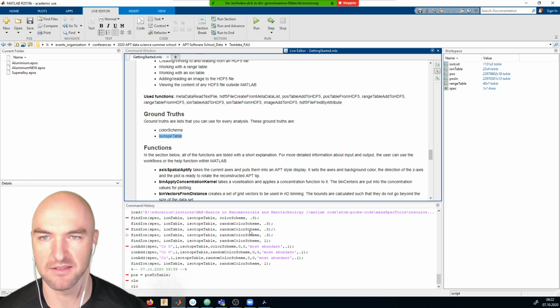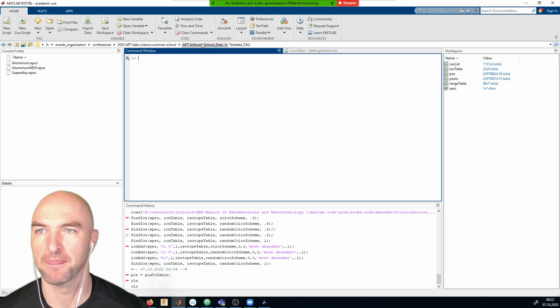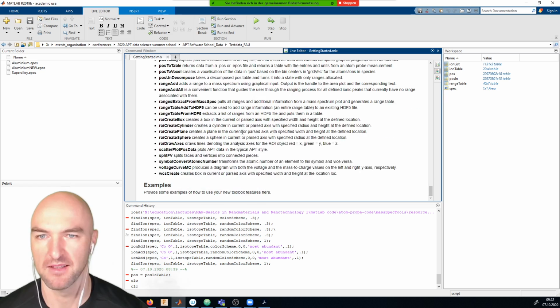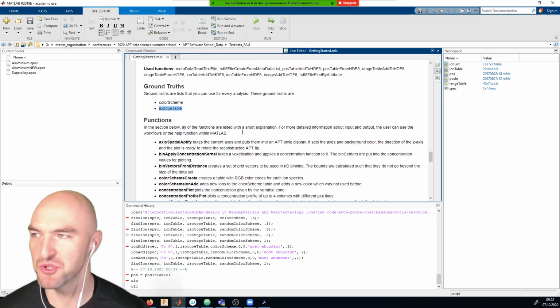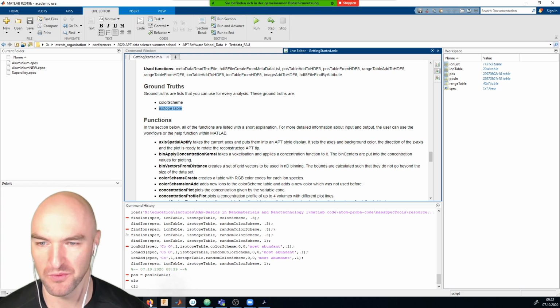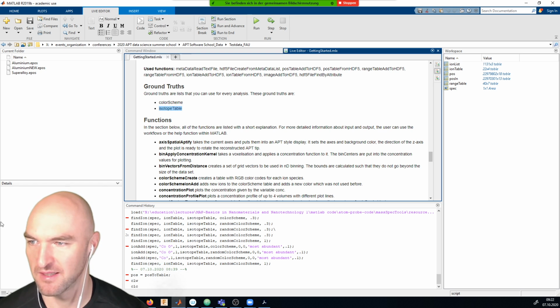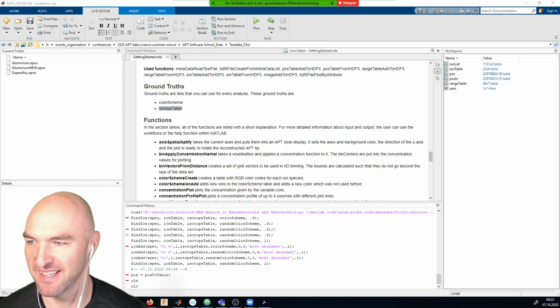I need to test that. Okay, usually I work off of the thing here. Okay, so how do I get to the isotope? Oh, thanks, Valentin.